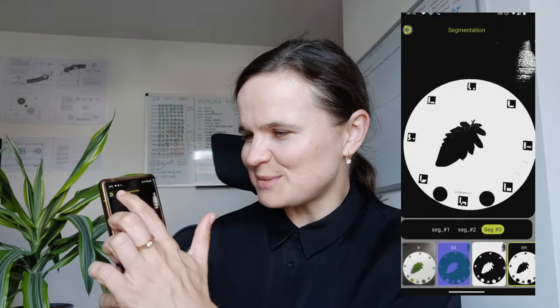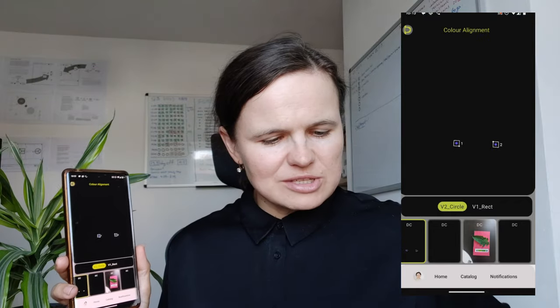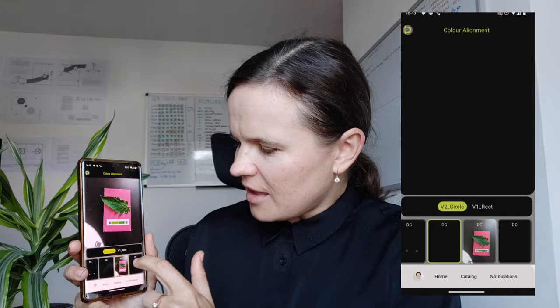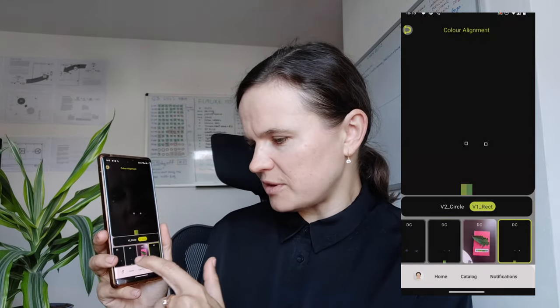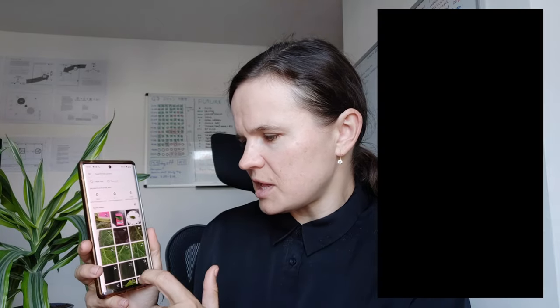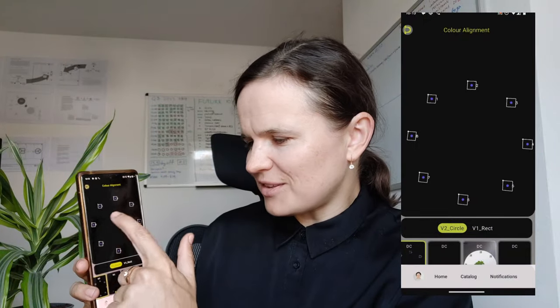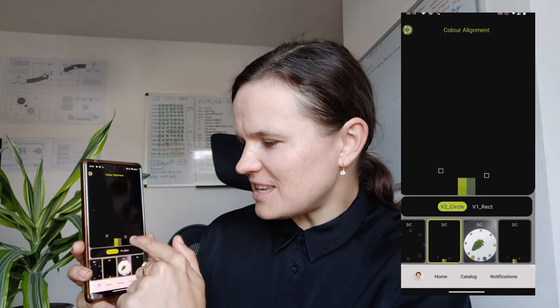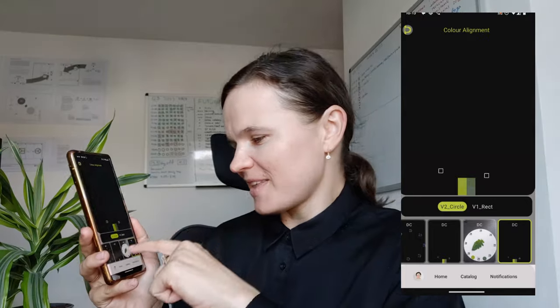In the future we hope to improve the segmentation process and give you freedom to edit and make improvements. As of now it provides transparency of the process — you can check the segmentation modules and different segmentation patterns. And finally we have Color Alignment — it's all about color calibrating pads and understanding whether the camera has seen the green markers or not. Here we have two markers from the color calibrating pad, and the updated color calibrating pad also shows eight markers plus the two green color markers.